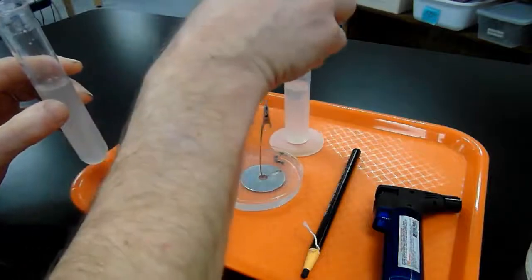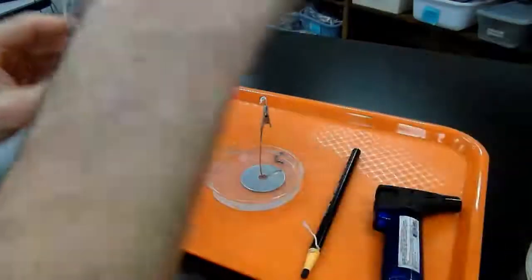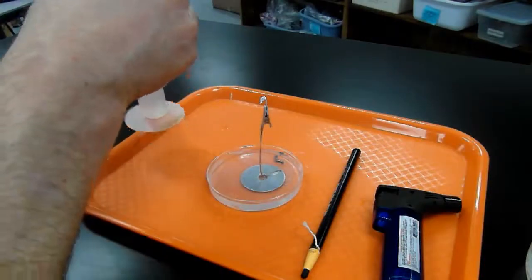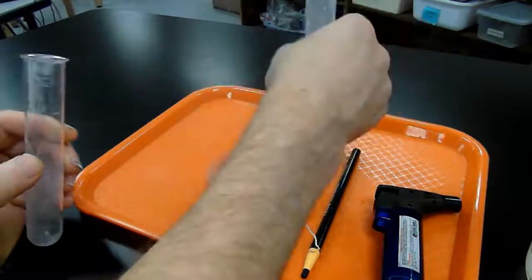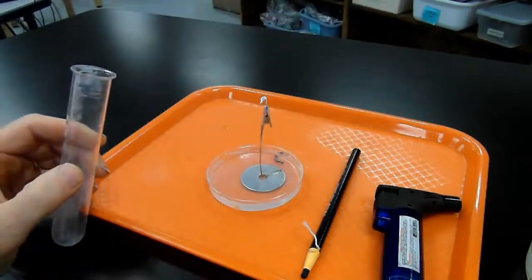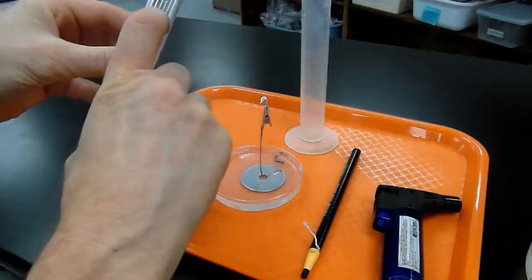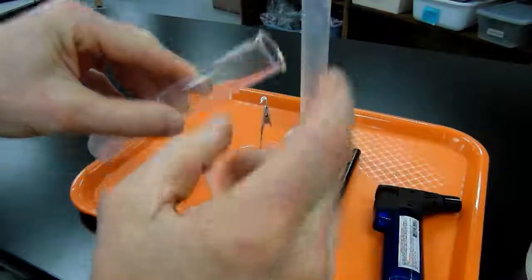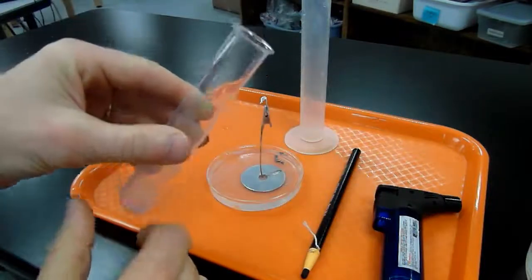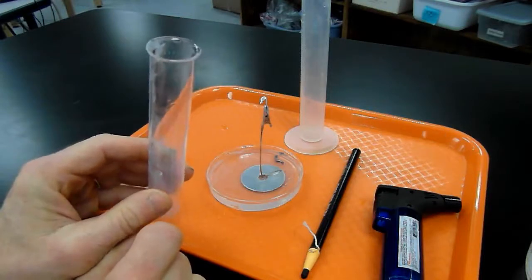And I'm reading 26. I'm reading 33, so that's 59 milliliters. And from those 2 volumes, to the mark and to here, I can figure out the amount of the volume that was displaced, and that divided by the volume of the test tube would be equal to my partial pressure fraction for oxygen in the test tube.